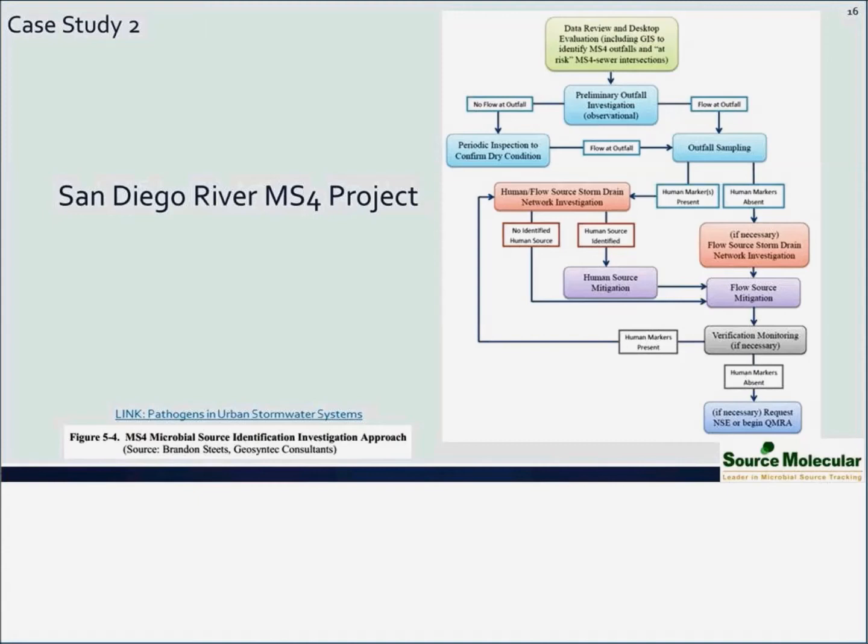Okay, I have a couple more that have come in. I see one here about wildlife, ducks, wetland, rice, discharge concern, deer, or other upper watershed pathogen issues. So there's a test that could potentially detect duck. Deer also, there's a test that can potentially detect deer. Those are two of the trickier sources.